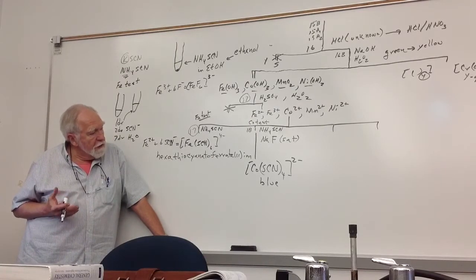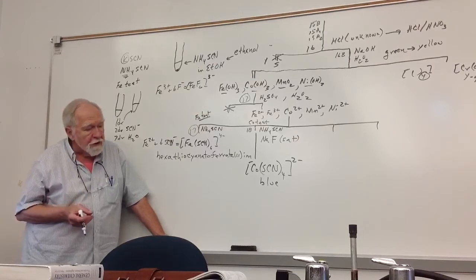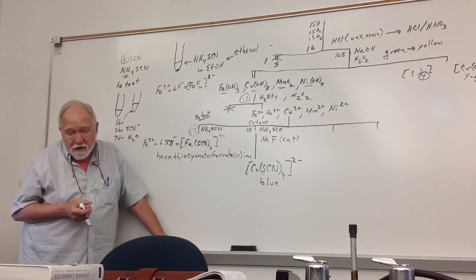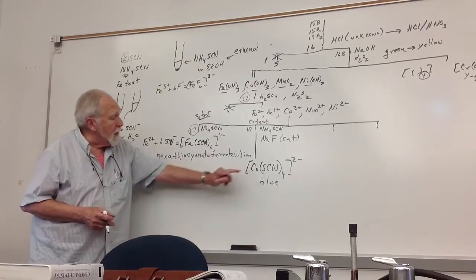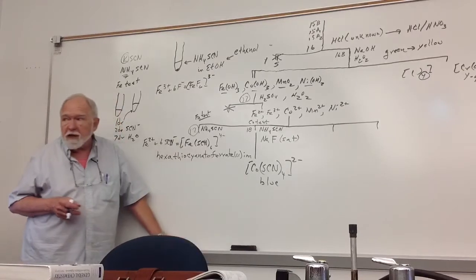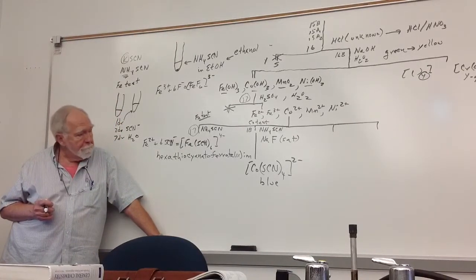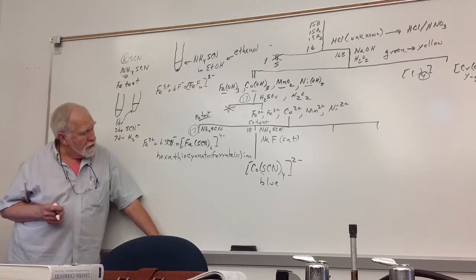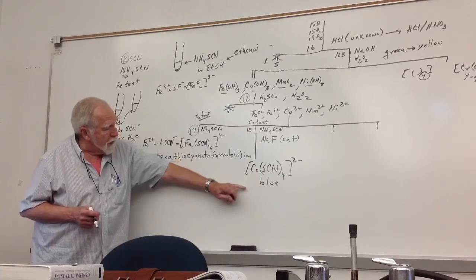Now here, the color isn't as bad. If it's really dark blue, it's a principal. Medium blue, medium. And light blue, a trace. And cobalt is not a common contaminant such as the iron, so you won't have a problem with that. So this is not a bad one, and by the way, people say, can I dilute it?